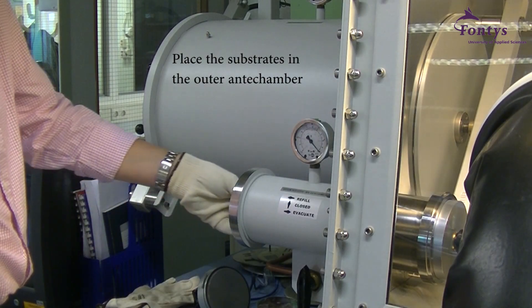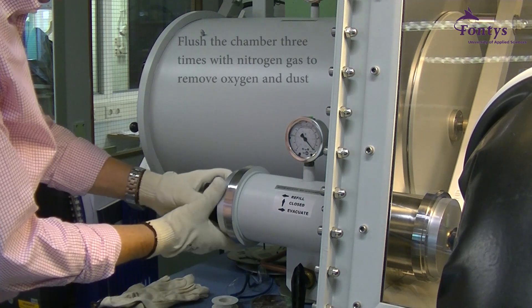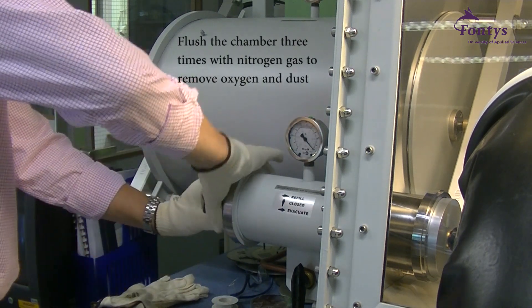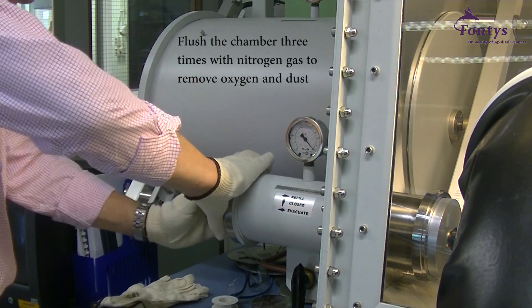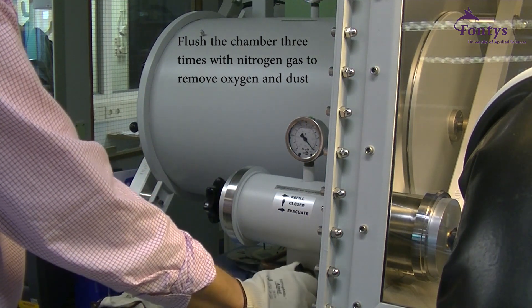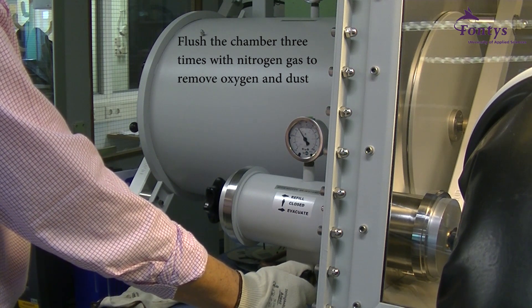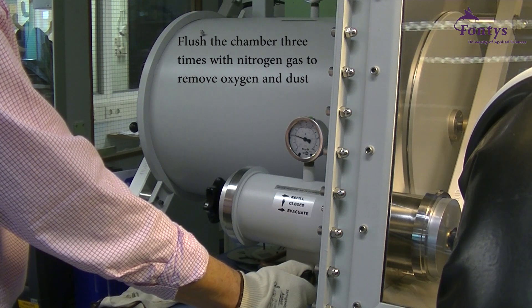To vaporize the aluminum cathodes on the substrates, place the substrates in the anti-chamber of the glove box and flush the chamber 3 times with nitrogen gas. By doing this, oxygen and dust are removed from the anti-chamber. This has to be done because dust has a negative effect on the smoothness of the layer during deposition. Also, oxygen can cause the aluminum to oxidize while it is being vaporized.